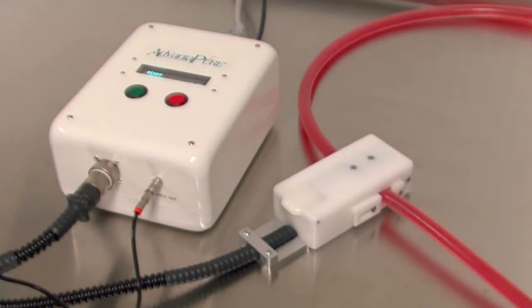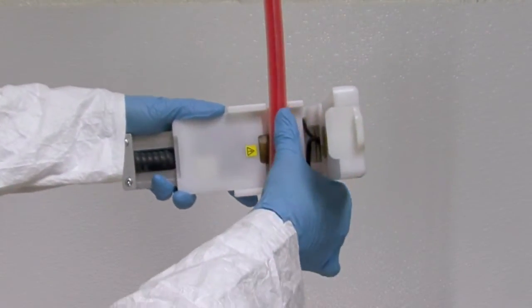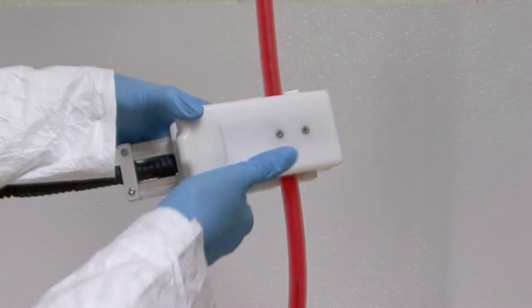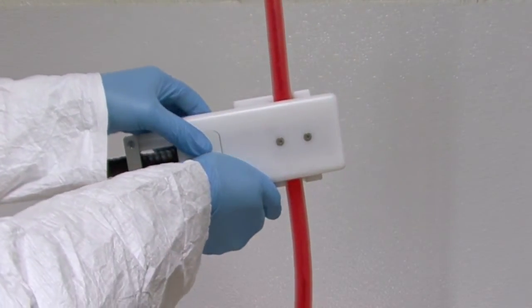The tubing is placed within the sealing head and the button on the base unit starts the process. With its portable lightweight sealing head, this unit, the Advantitube Sealer, works just as well on hanging manifolds and tubing as it does on a tabletop.